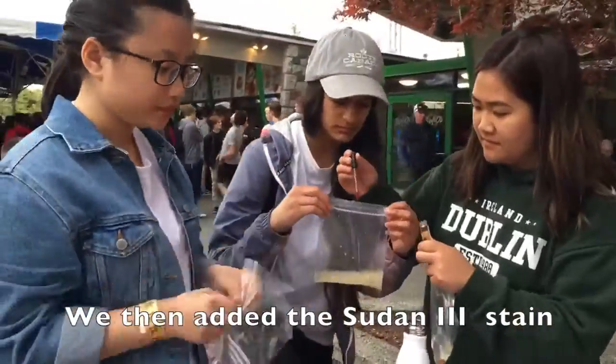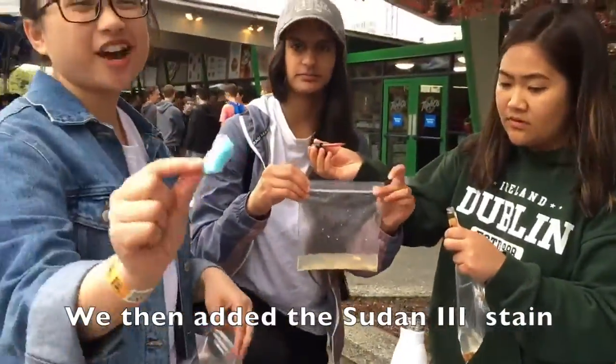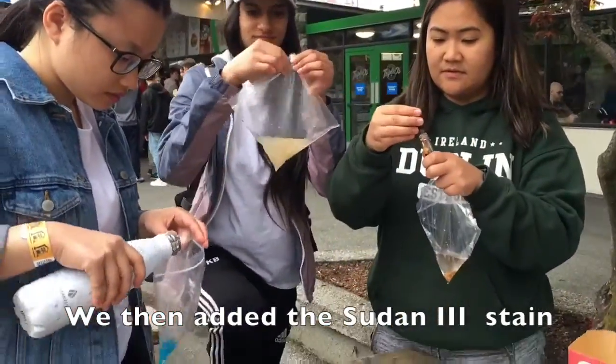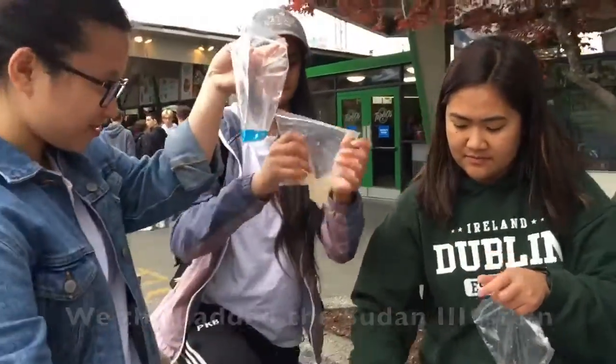We then added the Sudan 3 stain to the bags. If a fat is present, a red stained oil layer will separate out and float on the water surface.